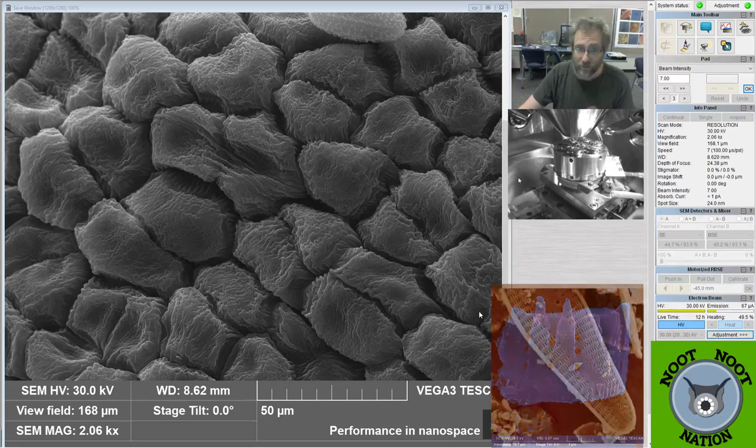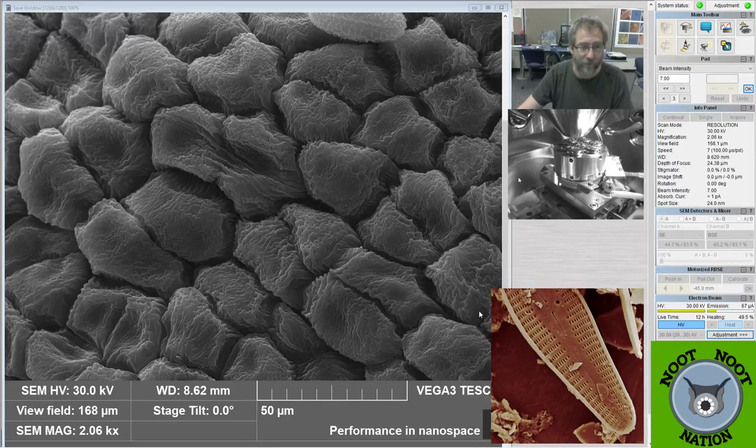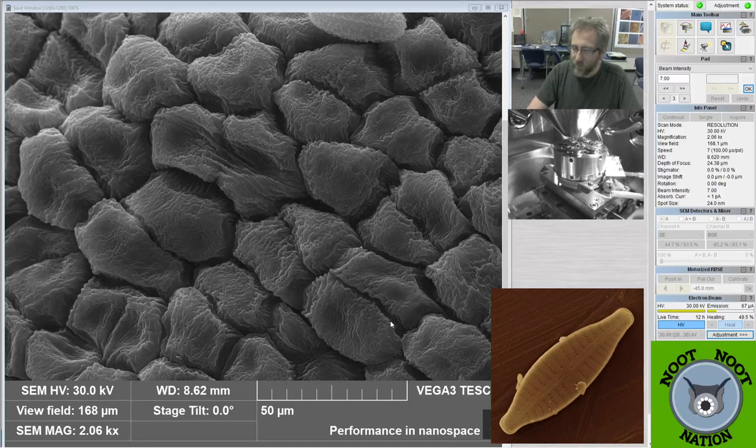But you're right, these ones definitely have a different shape. The ones from the Spring Beauty had a very specific shape, I thought. A lot of the other flower petal types didn't look that different. I mean, they look different than this one, but they didn't look that different from each other. They have kind of a fundamental shape that's similar. But this one, the leather leaf, is pretty different.